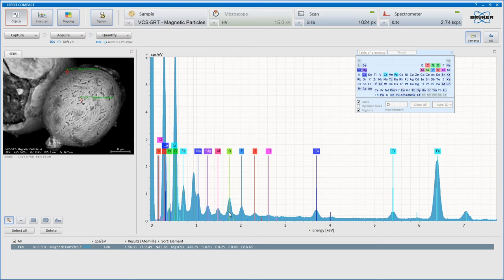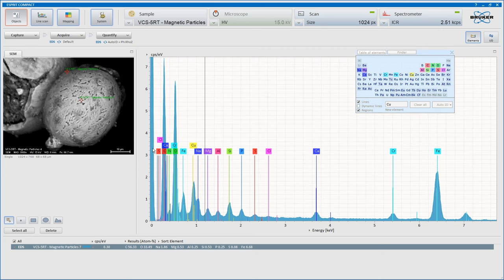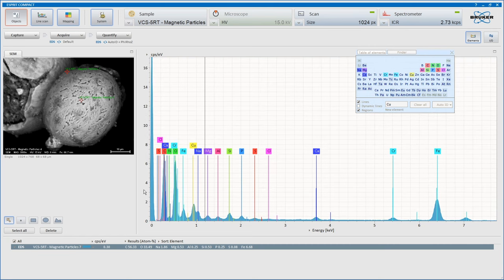I think we got everything covered, haven't we? Oh no, it's this line here. What is that line? Not zinc, although we might have zinc in there. Copper. Is it copper? Well, there are copper pipes in there, so it wouldn't be surprising. But we have all these other elements here. Not as significant as the iron and the oxygen and so forth, but still, there we go. So that is particle 7 here.